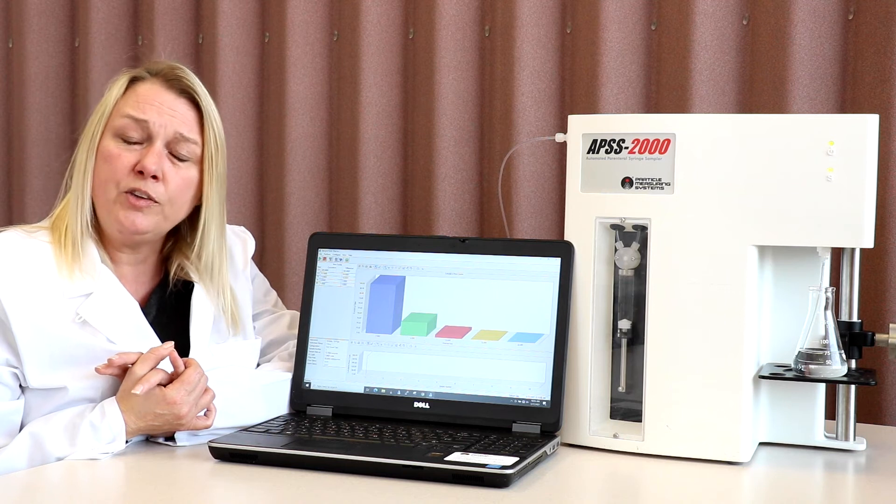If you send a sample out every week, the cost for the year is about $30,000 or more.